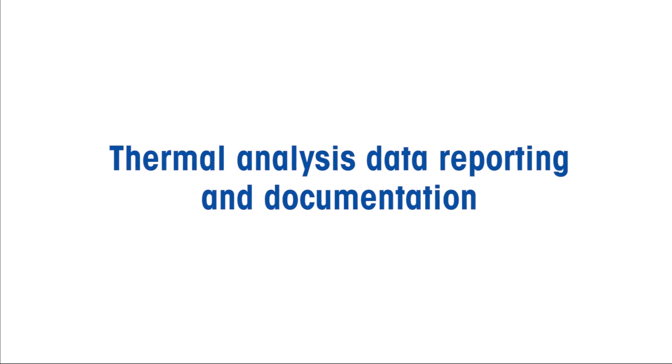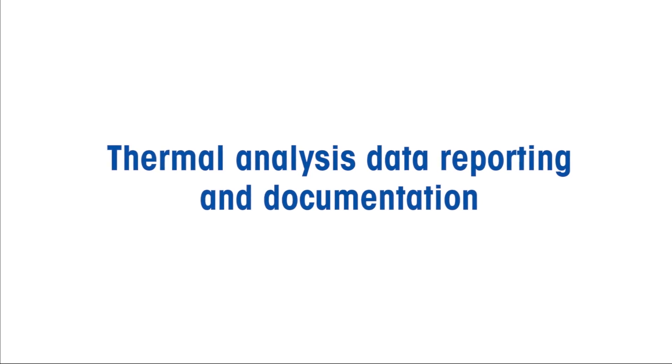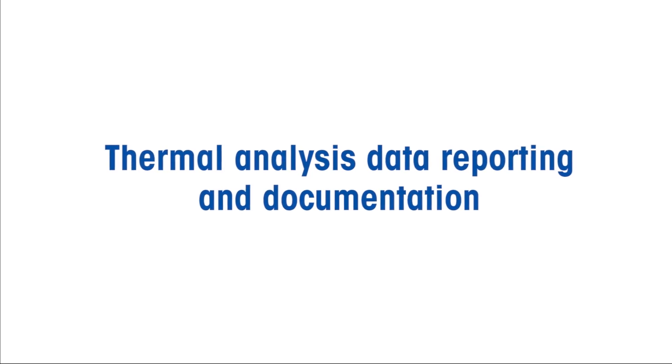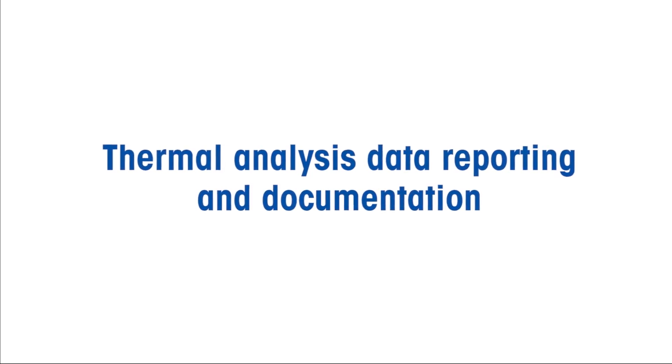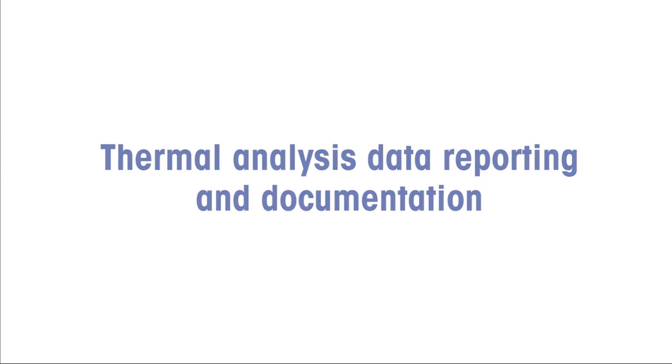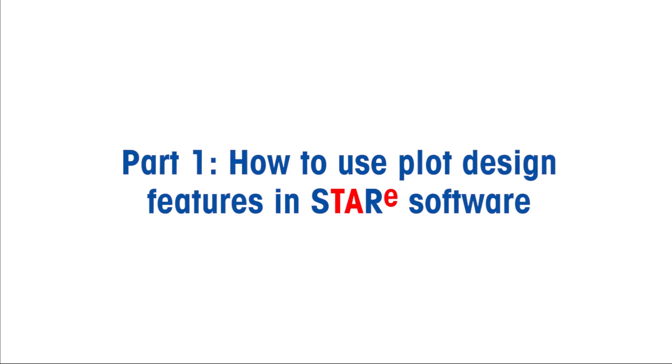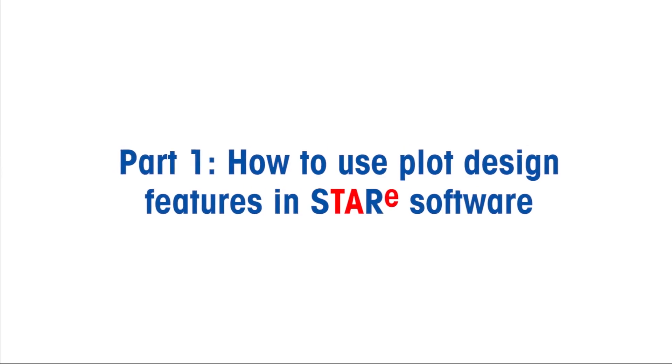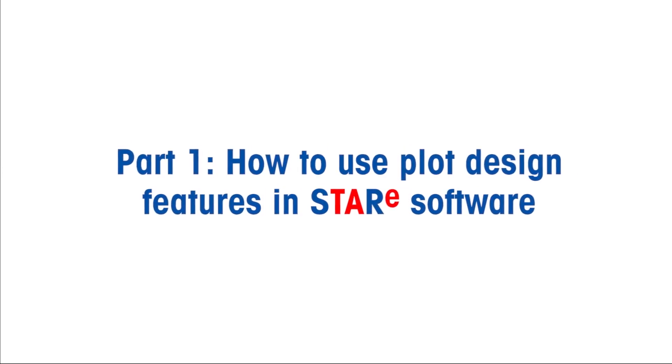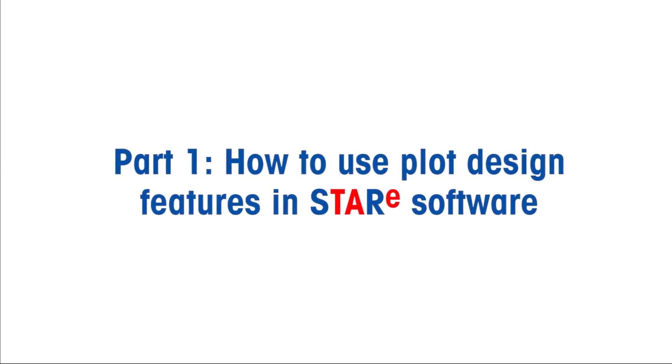Welcome to Mettler Toledo's how-to video series on thermal analysis data reporting and documentation. In part one, we will show you how to use plot design features in STAR-E software.